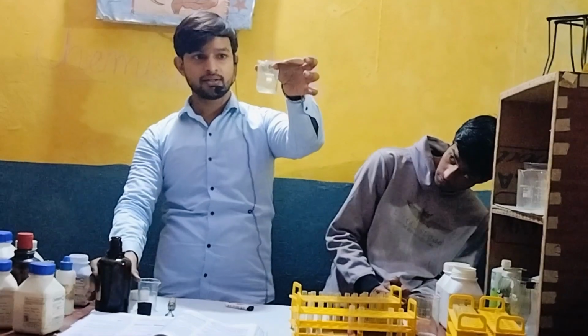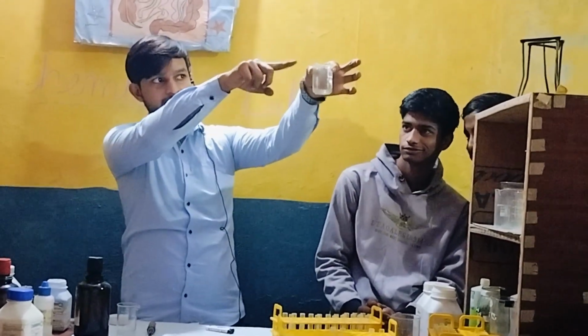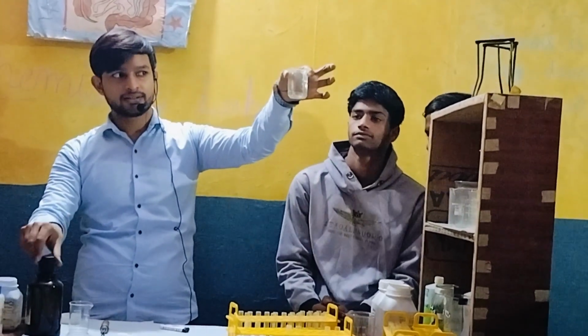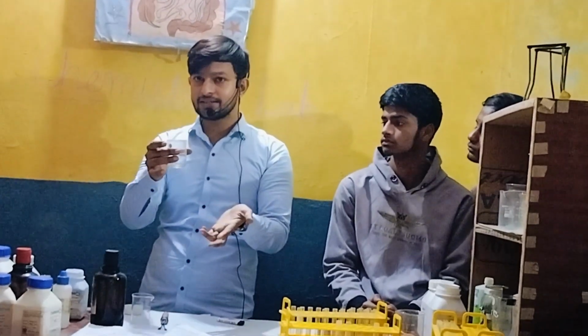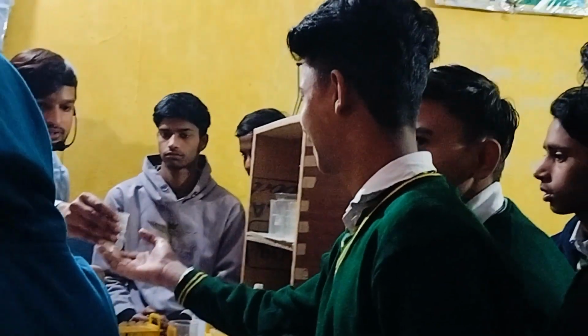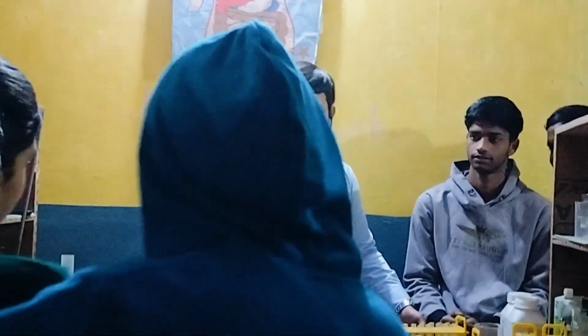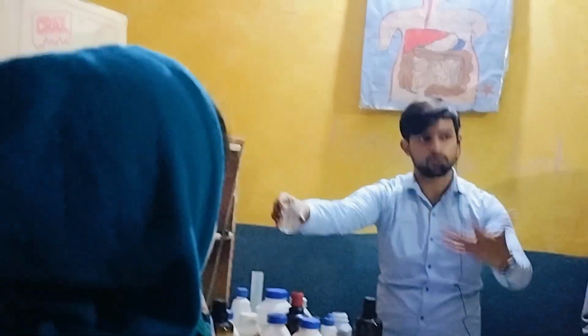Can you see something? Yes. So, the water will form and what other thing is formed? Salt. And everyone please touch, one by one. It is hot. It becomes hot. This is an exothermic reaction. Exo means heat will come out.